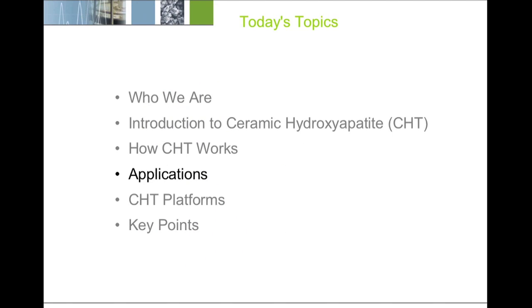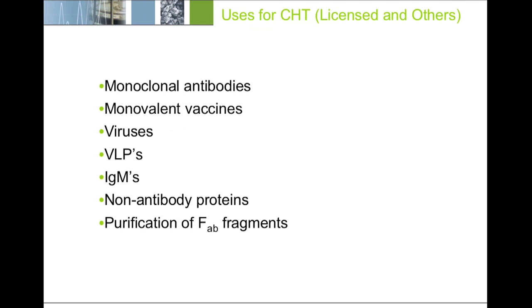Next, applications using CHT. CHT is used for purification of a wide variety of biomolecules, including monoclonal antibodies, viruses, IgMs, and non-antibody proteins.